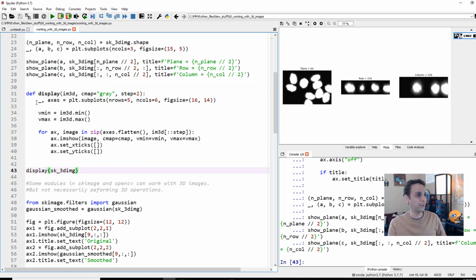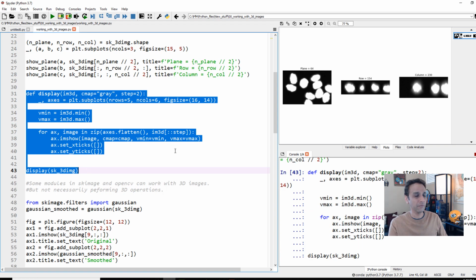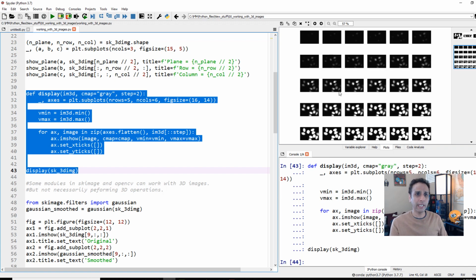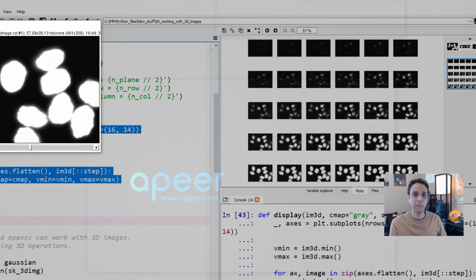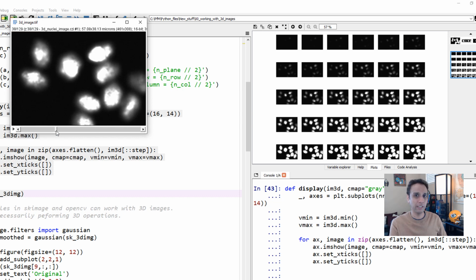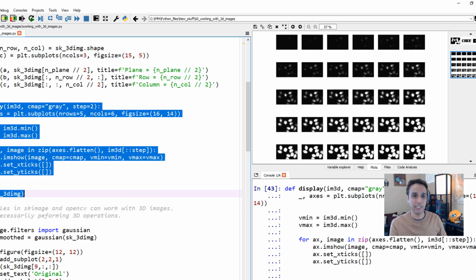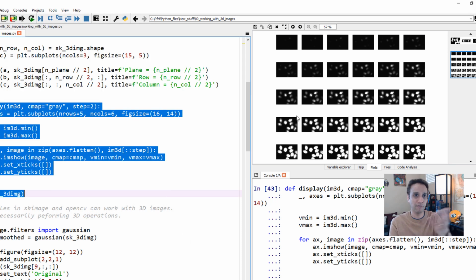And also let's go ahead and look at each of these slices. The first few of these, so you get an idea of what we're talking about. This is the 0th, first, second, third, fourth, fifth, and so on. I'm just showing you a couple of ways to look at this. We are plotting all the way up to here. I'm using ImageJ to go through these images, but in case you don't have a way of visualizing them, of course you can plot and look at them here. So far so good.